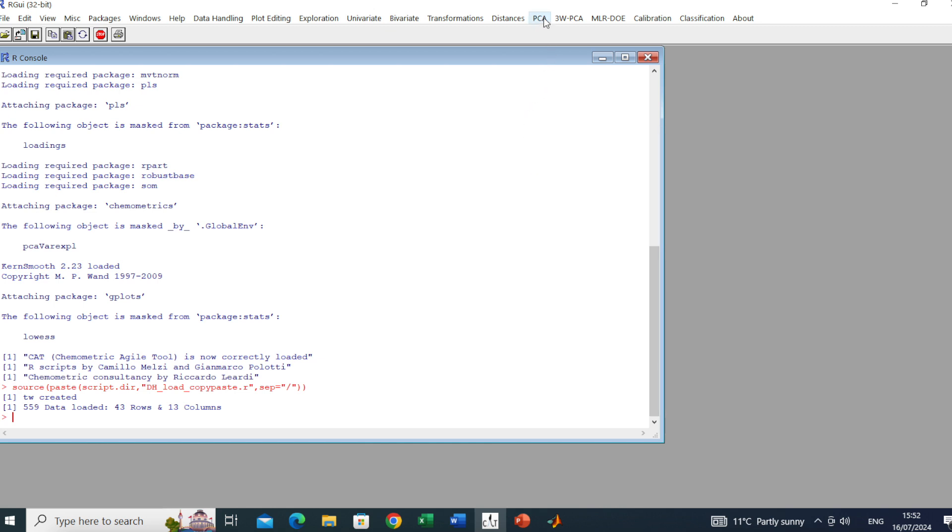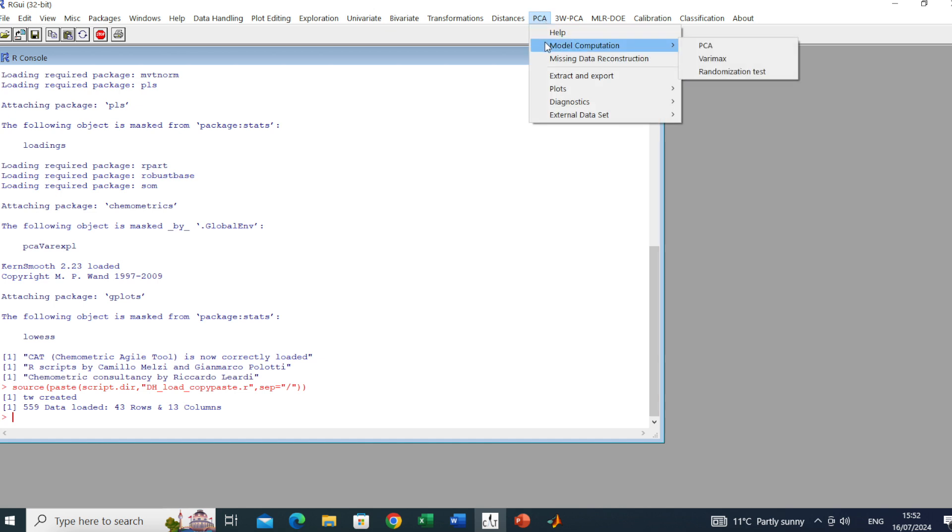To do the PCA we go here, we have the drop-down menu and we go to Model Computation, and we click on PCA.